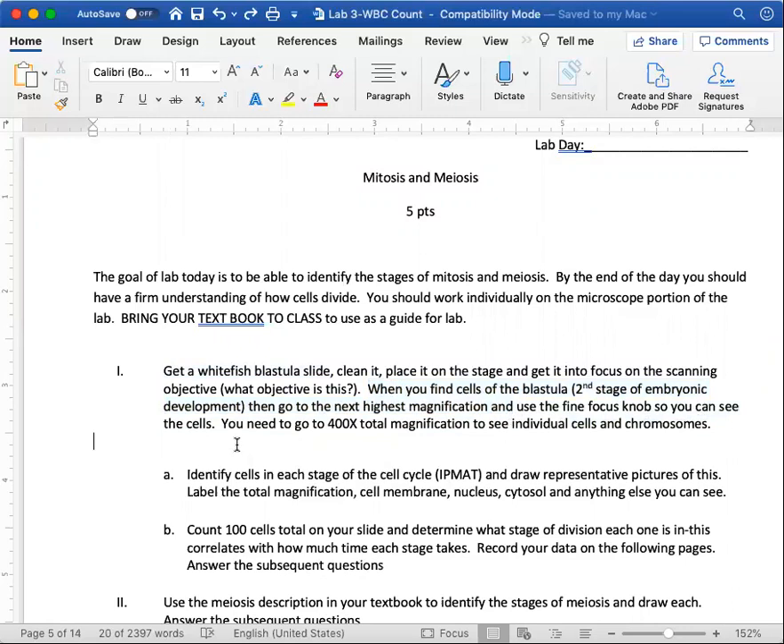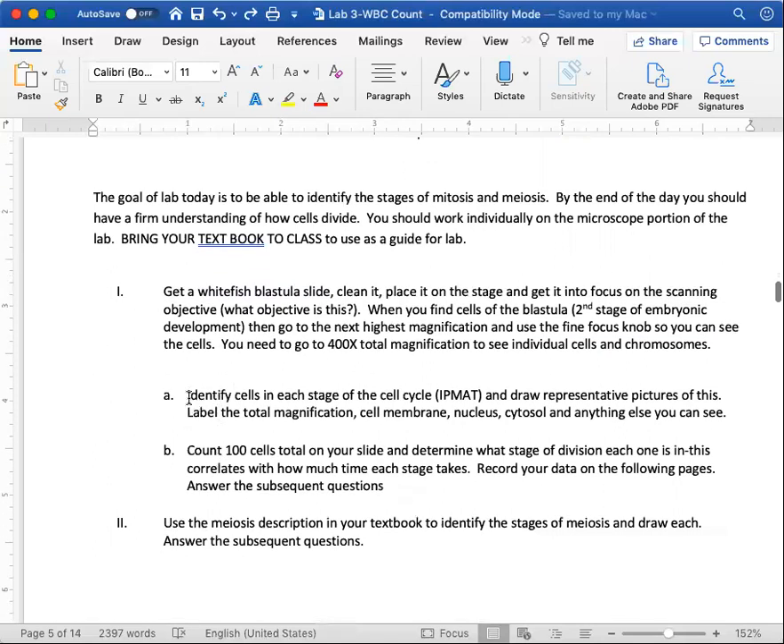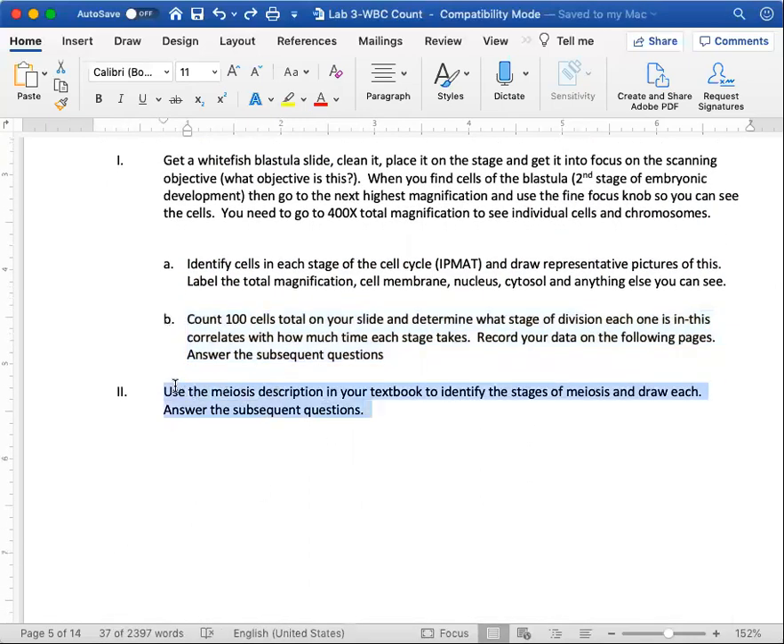You need to go into that ball of cells and find different cells in different states of cell division. Identify cells in each stage of the cell life cycle: find one in interphase, prophase, metaphase, anaphase, and telophase. Label the cell membrane, nucleus, and cytosol. You don't have to worry about total magnification since we're online, and you don't have to do Part B.